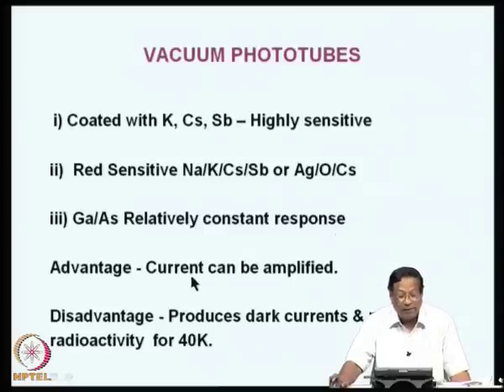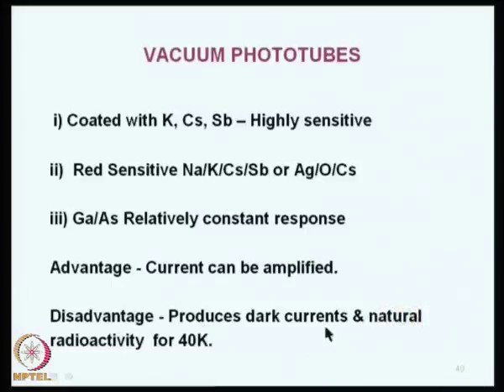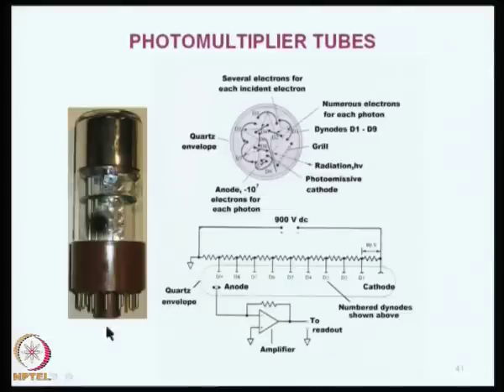The advantage is current can be amplified, but the disadvantage is it produces dark current, and because of potassium-40, it gives some amount of natural radioactivity, which is not good for usual maintenance. Then we have a photomultiplier tube. This is used for very low light sensitivity, for example, longer wavelength regions.